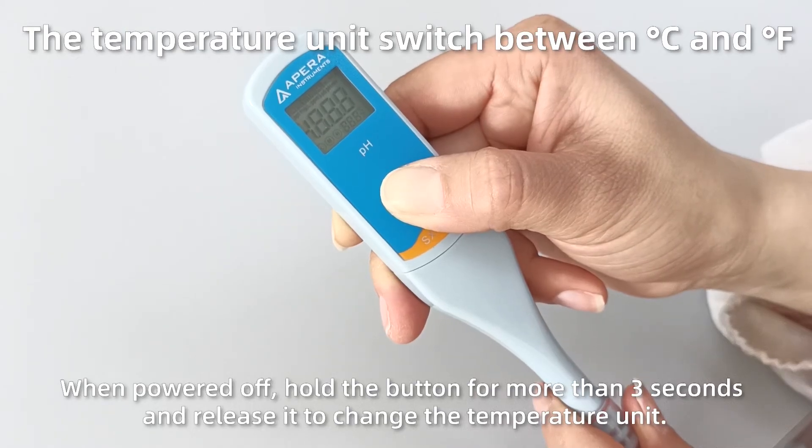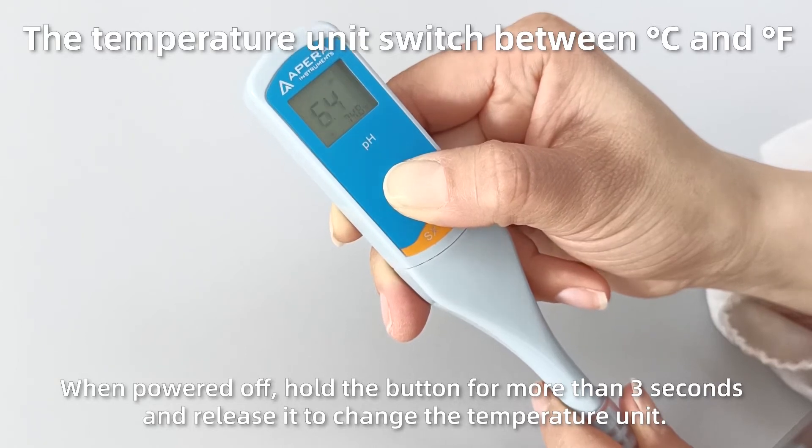When powered off, hold the button for more than 3 seconds and release it to change the temperature unit.